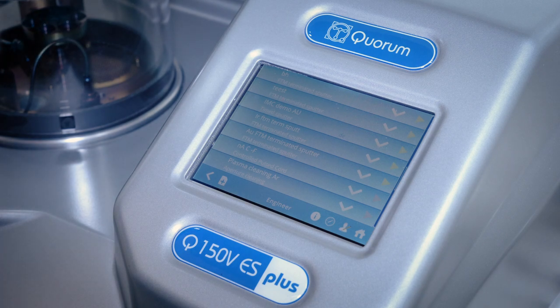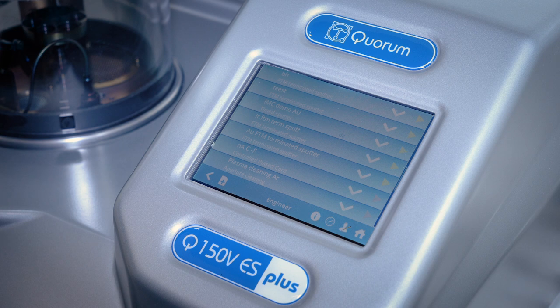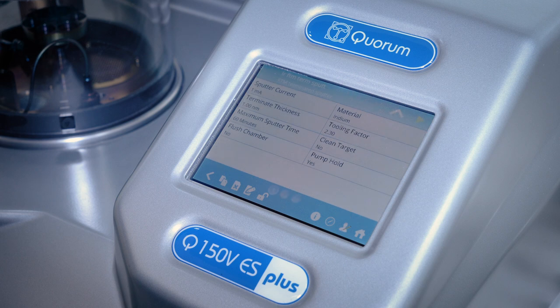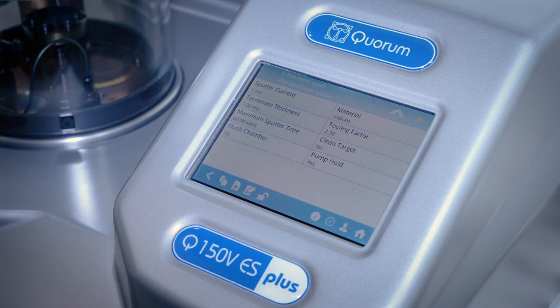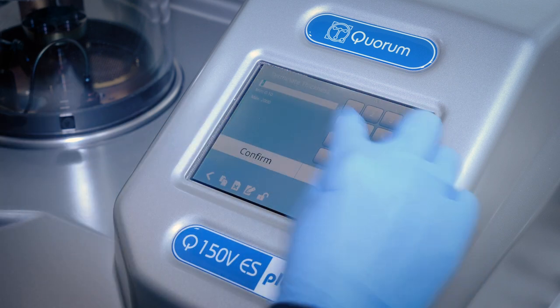To run a coating process, you need to simply choose an appropriate recipe by pressing the blue arrow. This opens the recipe parameter window where we can edit conditions or activate, deactivate actions like target cleaning or stage rotation. The parameters of coating are predefined, but they can be changed by typing in the desired values.